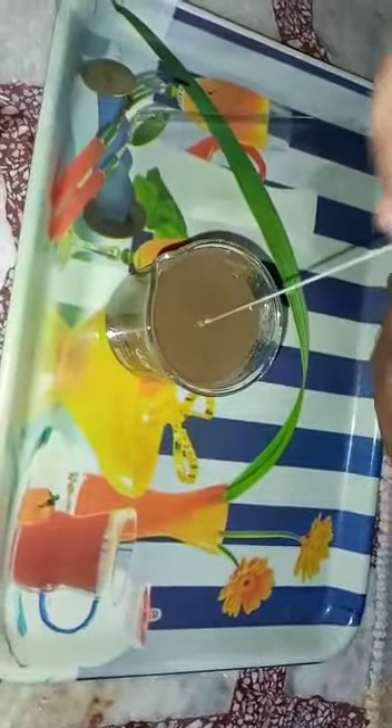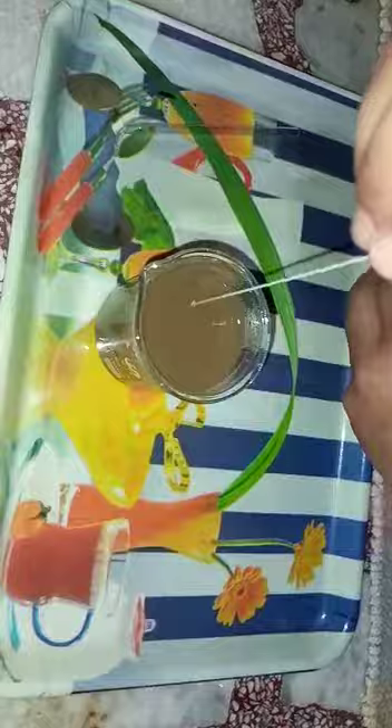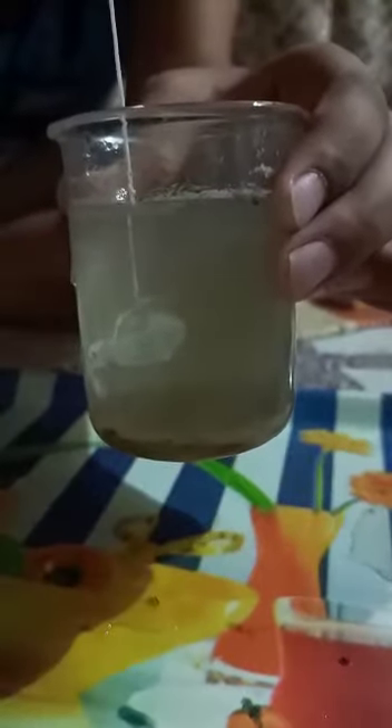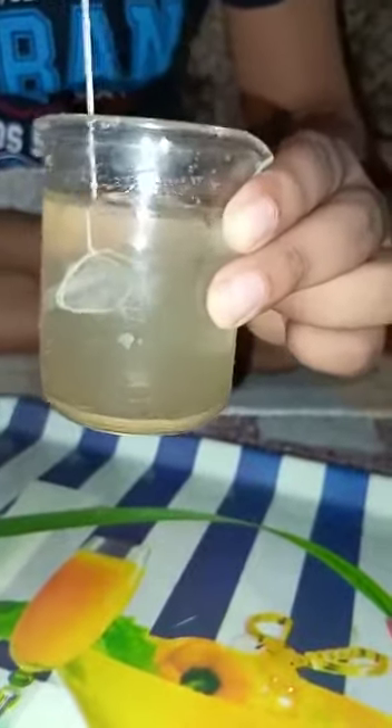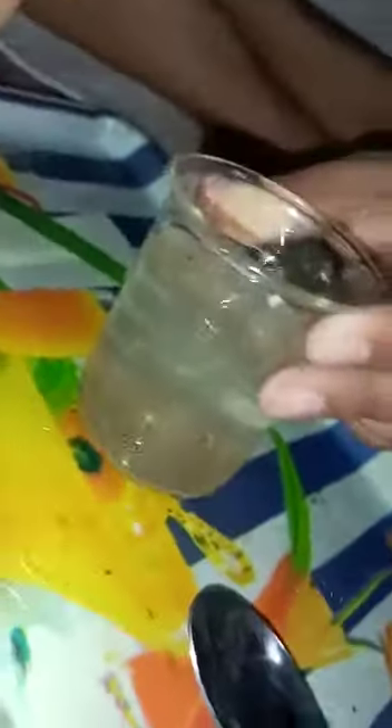It will take 2 or 3 minutes. Slowly, the particles are sitting down. So, the particles are settled down. I will remove the alum. You can see the particles of mud are at the bottom and the fine particles are in the middle. You can see some particles of the mud are in the middle.